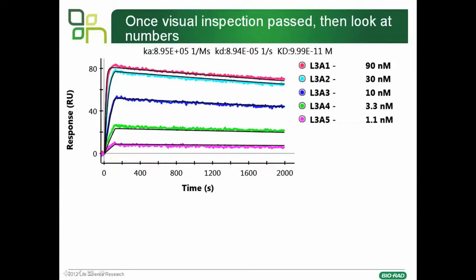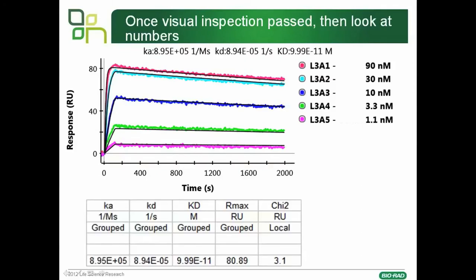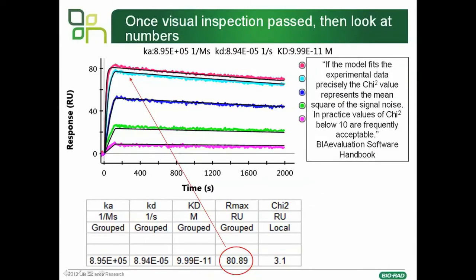Once the visual inspection is passed — i.e., the fit lines pass through the middle of the experimental data — it is then time to look at the numbers. These are our rate constants generated, along with the Rmax and the chi-squared. The first thing to do is look at the Rmax to see that it corresponds to the Rmax from the sensorgram. You can see that the response is saturating around 80 RUs, and this is indeed the reported Rmax value. In terms of chi-squared — the difference between the fitted data and the experimental data — the BIAevaluation software says that chi-squared values less than 10 are frequently acceptable.